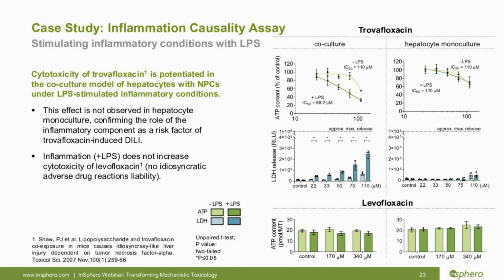inflammatory component. And we would like to demonstrate this application with an example of 2 well-known antibiotics. The infamous trovafloxacin that was eventually taken out of the market due to acute liver failure and cell death, and levofloxacin with no associated idiosyncratic adverse drug reactions.